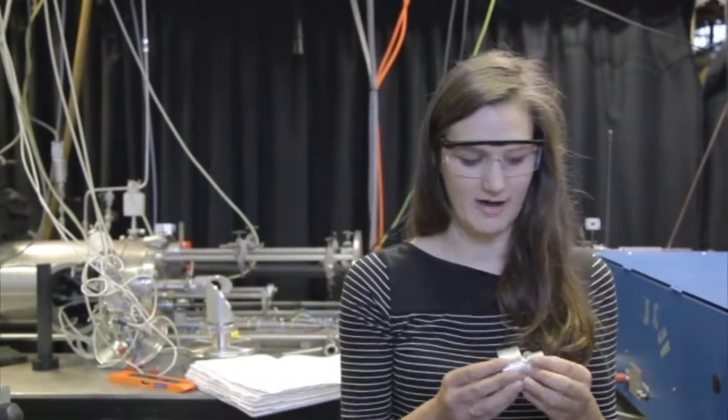Basically I'm using the supersonic expansion of gas through a Laval nozzle, which is one of these, to cool my gaseous reagents down to temperatures as low as about 60 Kelvin. So to measure the rate coefficients, I'm using lasers. So I'm using pulse laser photolysis, laser-induced fluorescence of a radical, which is the hydroxyl radical.